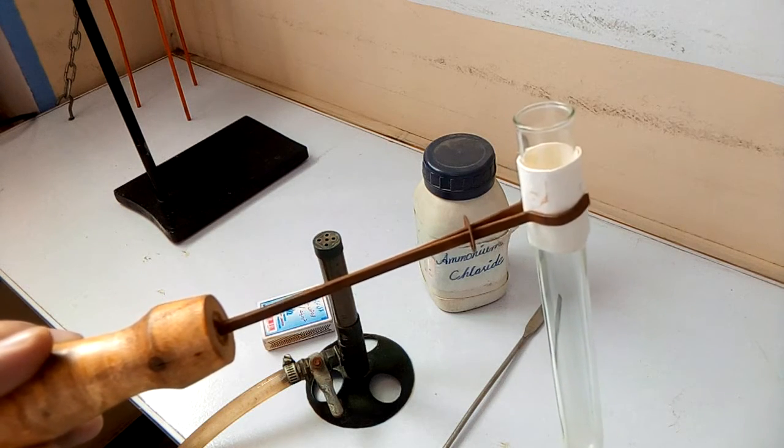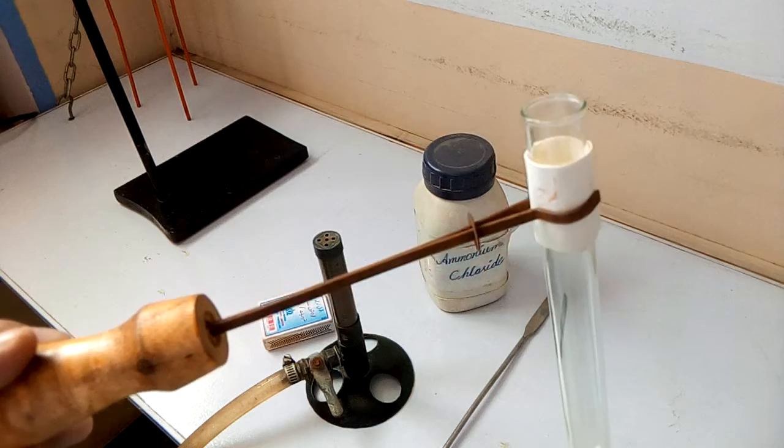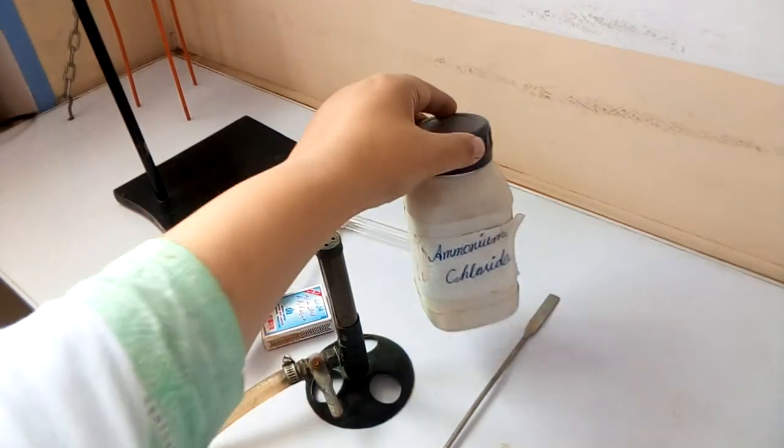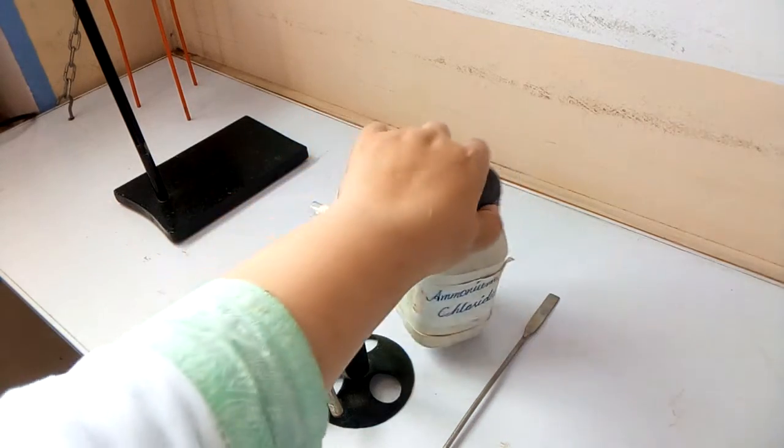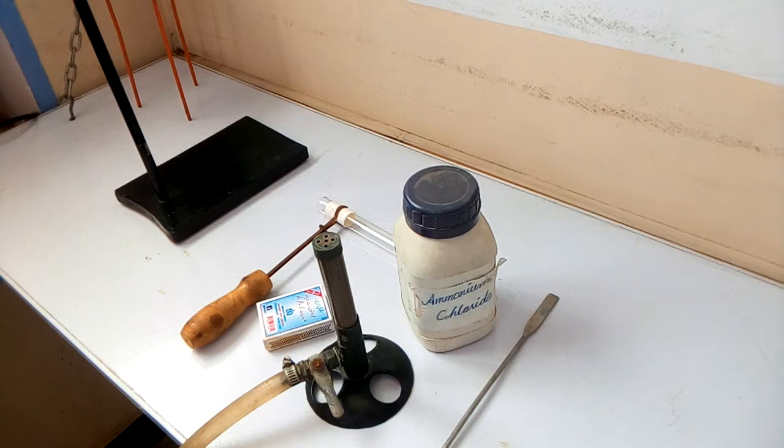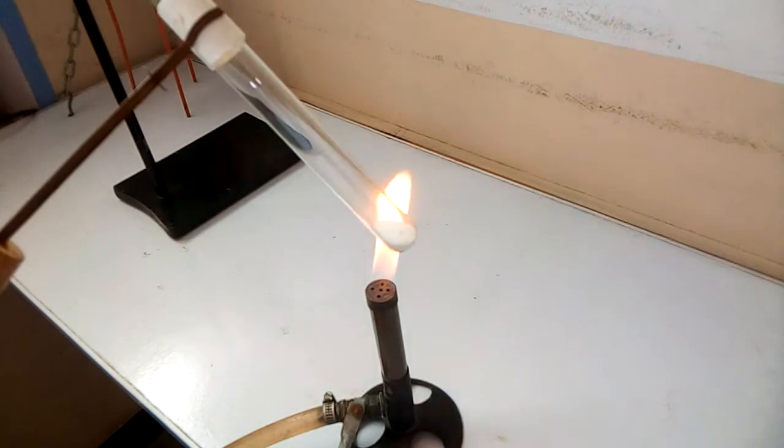We also need ammonium chloride, we will take 5 grams of this, a matchbox, and a Bunsen burner. Now we will take about 5 grams of solid ammonium chloride in a clean dry test tube.